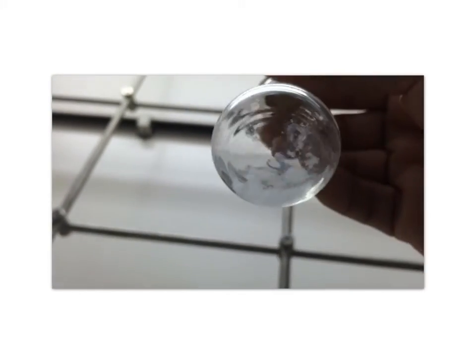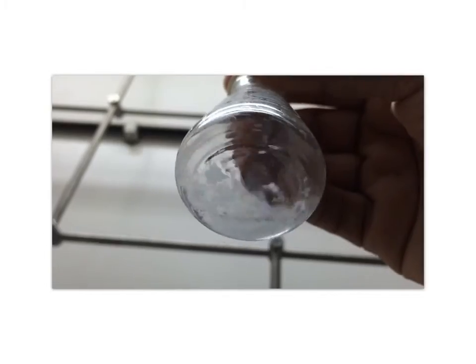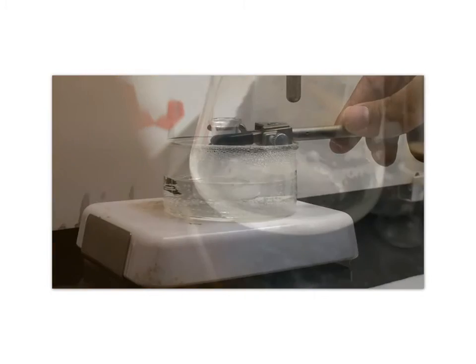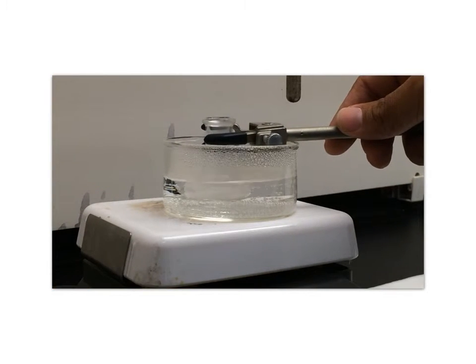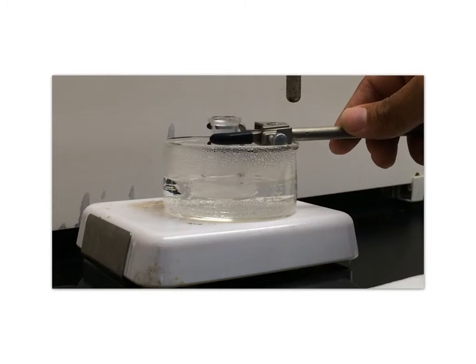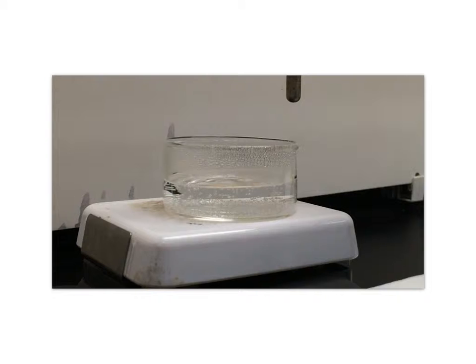The last one of the remaining compounds that we tested for was a neutral compound. All we had to do for this last step was to transfer the remaining ether into a small flask, add 1 ml of water to wash it, and then add sodium sulfate, which was a drying agent that absorbed all the water that was in the mixture and left us only with the ether and the neutral compound, which should be dissolved in there.